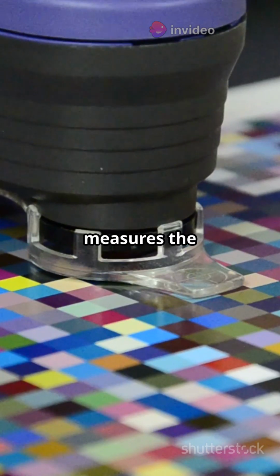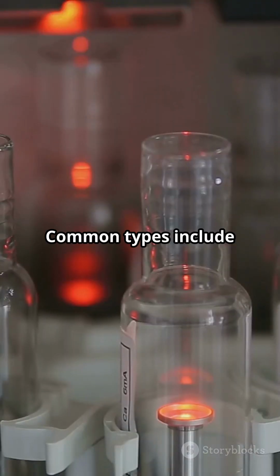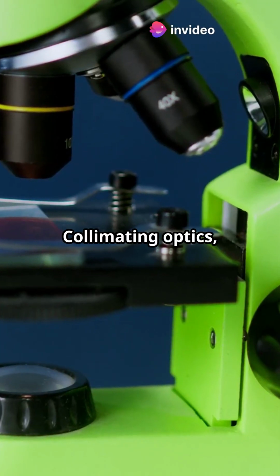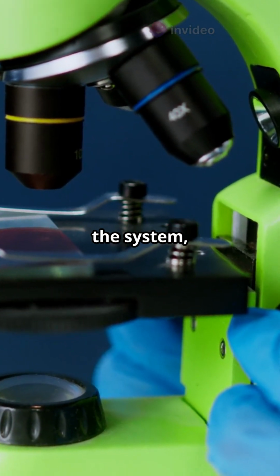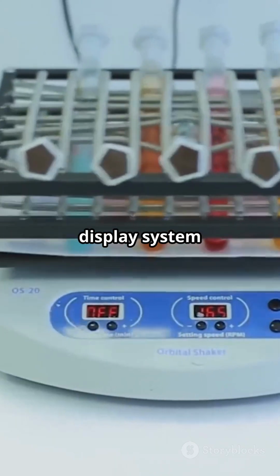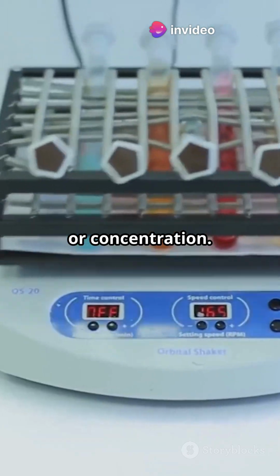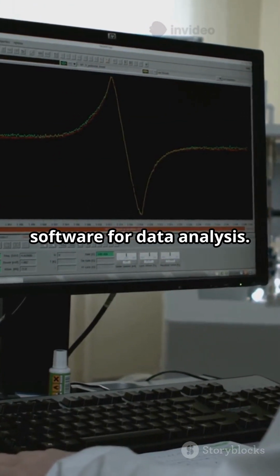The detector measures the intensity of light transmitted through the sample. Common types include photomultiplier tubes, photodiodes, or charge-coupled devices for high sensitivity. Collimating optics, such as lenses or mirrors, focus and direct the light beam through the system, ensuring a parallel beam for accurate measurements. The readout or display system processes signals from the detector and displays results as absorbance, transmittance, or concentration. Modern systems often include digital interfaces and software for data analysis.